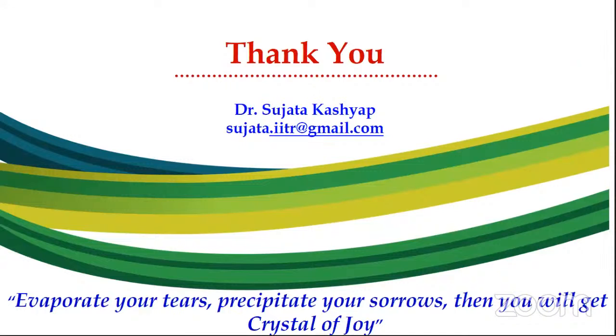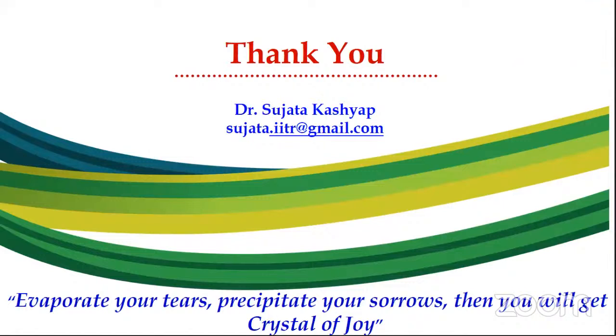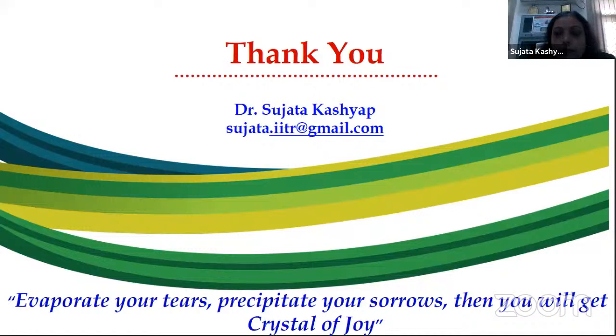Thank you so much, ma'am, for this wonderful session with good demonstrations. I would like to address 2 questions from the audience, ma'am. Yeah, sure, ma'am. So the first question would be, how much R factor is good enough for a good crystal? Okay. How much R factor is good enough?